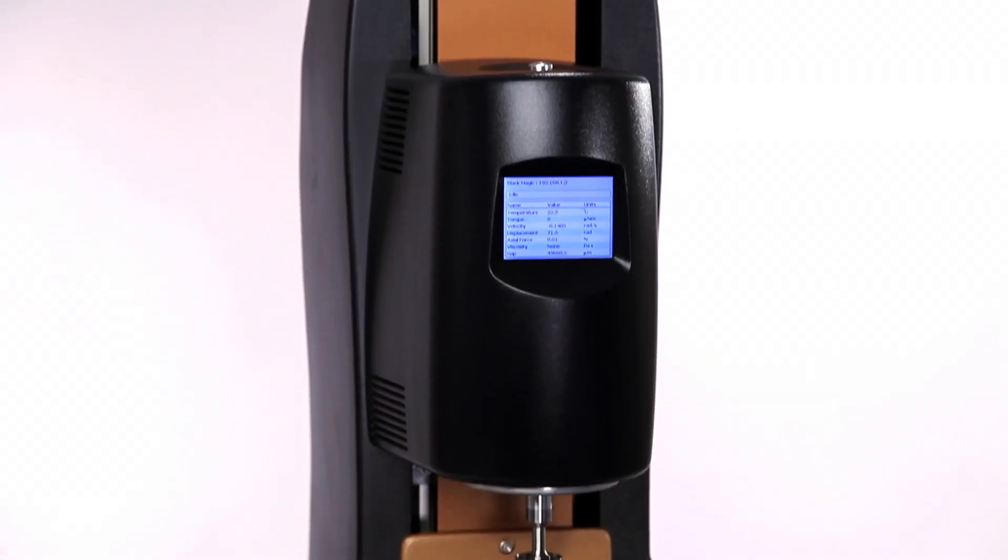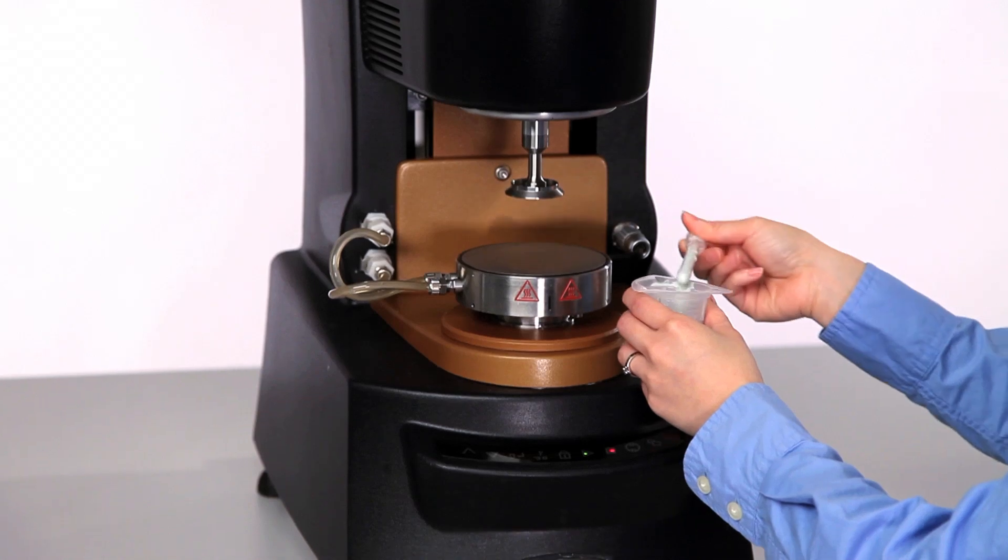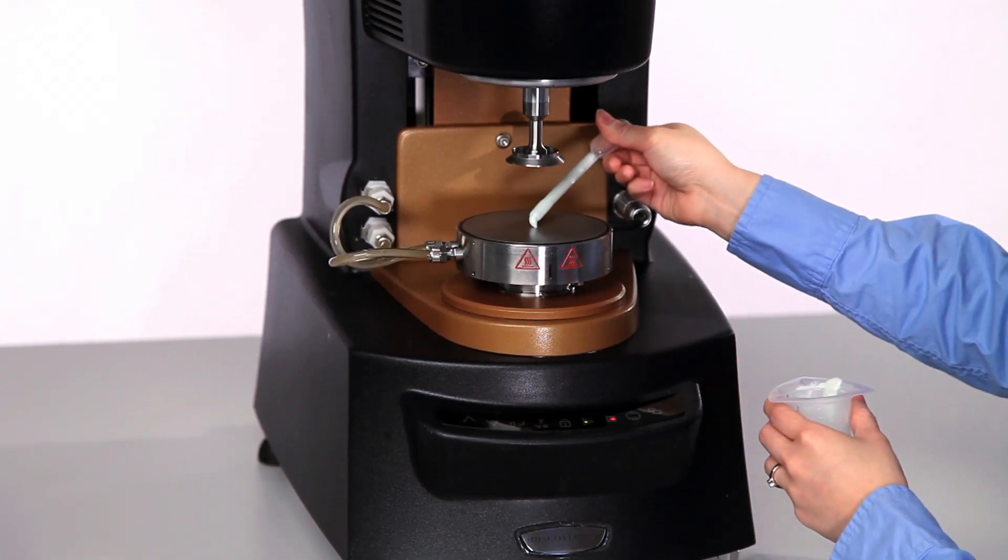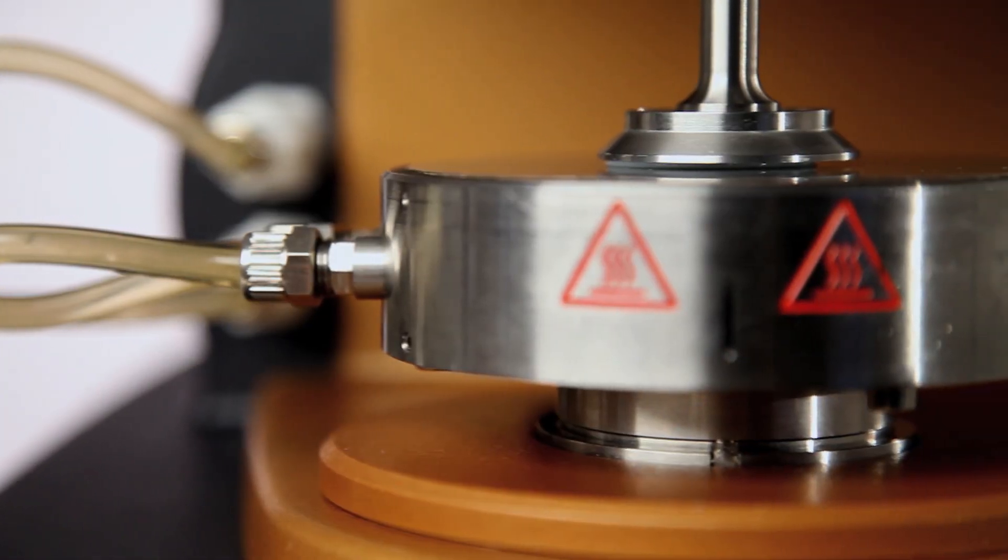When loading many fluids or soft solids it is often hard to judge the appropriate amount needed to achieve a correct fill under the geometry. Many times too much sample is used and sample trimming is required. But what if there's not enough sample?